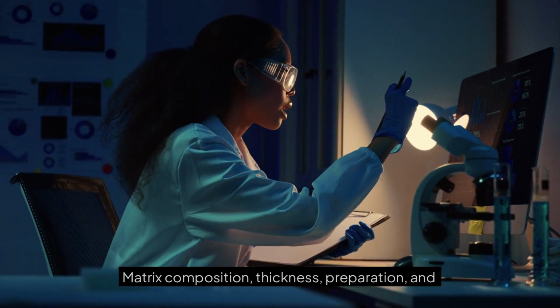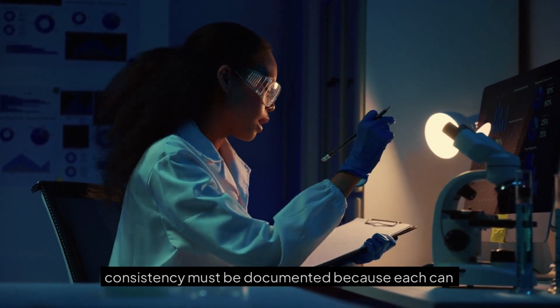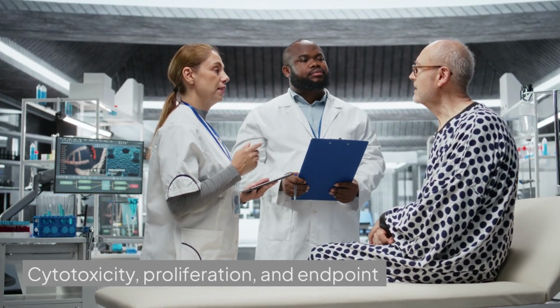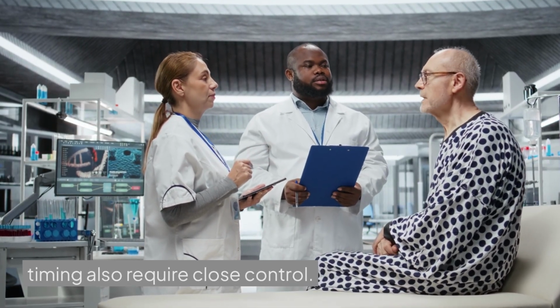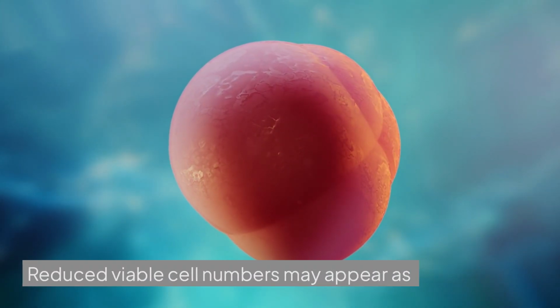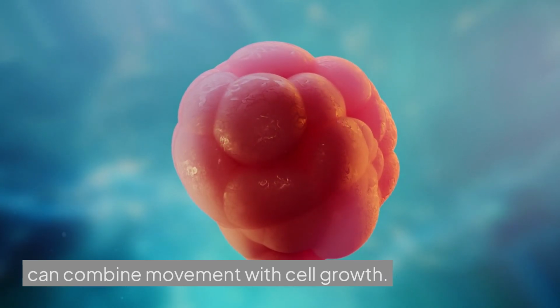Matrix composition, thickness, preparation, and consistency must be documented because each can change the difficulty of traversal. Cytotoxicity, proliferation, and endpoint timing also require close control. Reduced viable cell numbers may appear as reduced motility, while extended incubation can combine movement with cell growth.